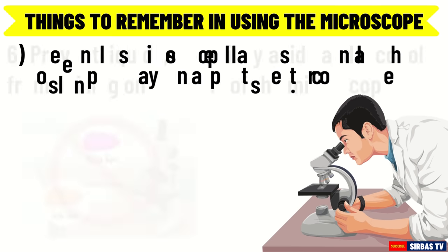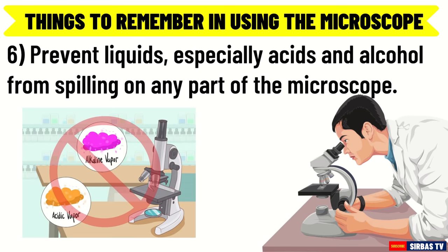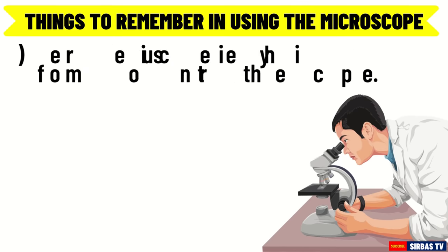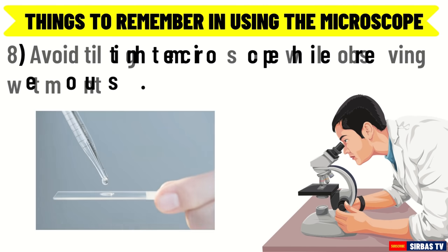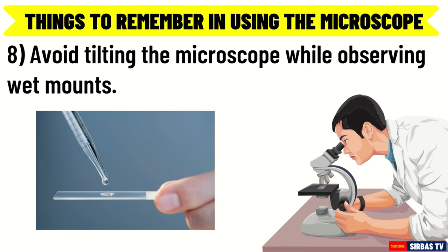Do not touch the glass parts of the lenses with your fingers. Number 6: Prevent liquids, especially acids and alcohol, from spilling on any part of the microscope. Always use a coverslip when observing wet mounts. Number 7: Check for moisture such as from condensation of human breath in the eyepiece. This may happen due to prolonged observation of specimens. Wipe with lens paper.